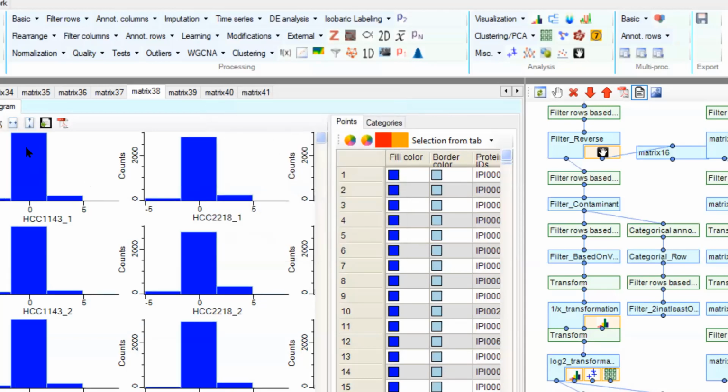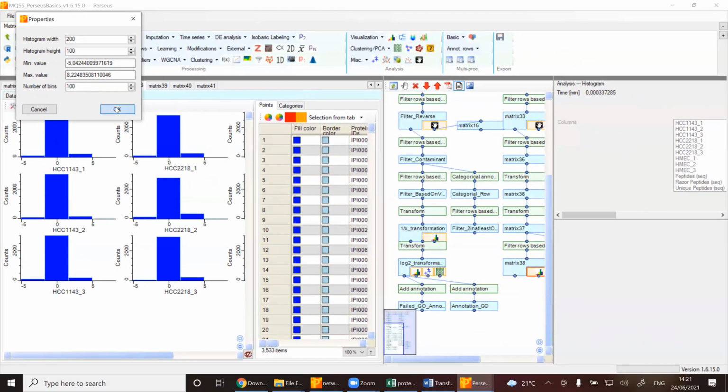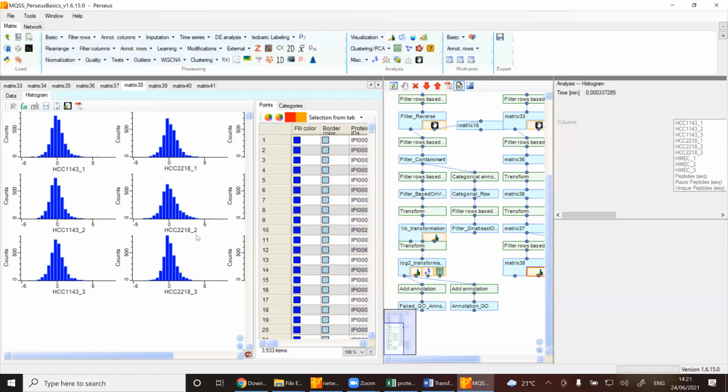And then we end up like this. But of course, this doesn't give you so much information because you have a really large bin here around the 0 and you don't really see the distribution. Of course, you can also say, okay, I want to go much higher. Let's say we go to 100 bins, and then you can see an even better distribution. But as I said, the default setting of 29 is already pretty useful and pretty good.